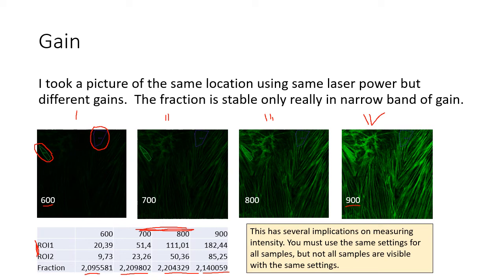So that's good. However, the implication here is that if you are quantifying intensities on the confocal, which you shouldn't be doing, but if you are still doing it, and your samples have a really huge variety of intensities, then the intensities you measure do not accurately represent the differences in the amount of fluorophores in the sample. They show the tendency, but the fraction is not accurate.